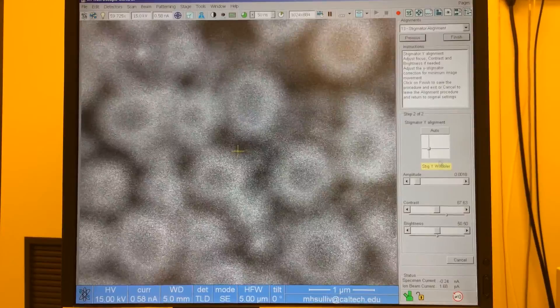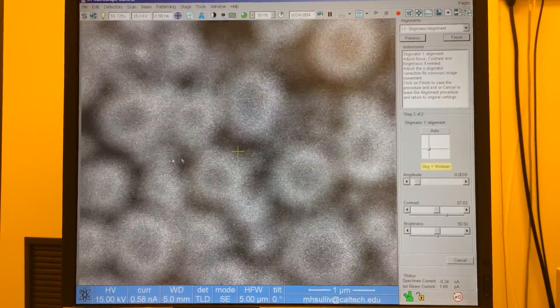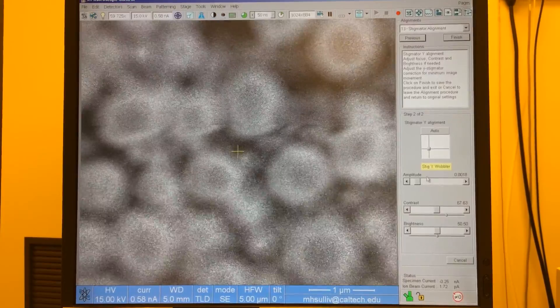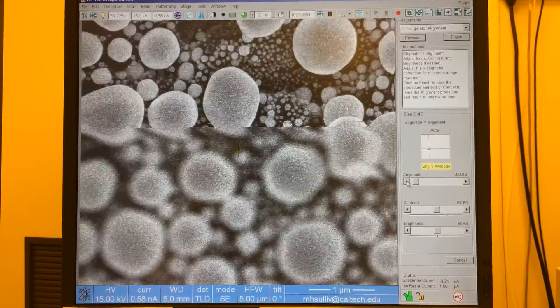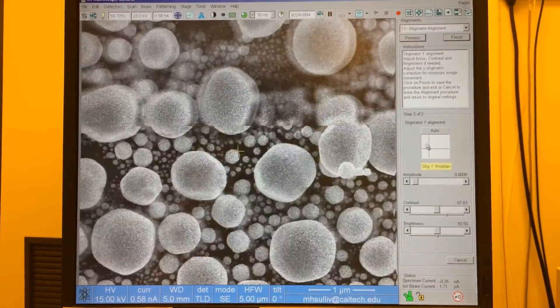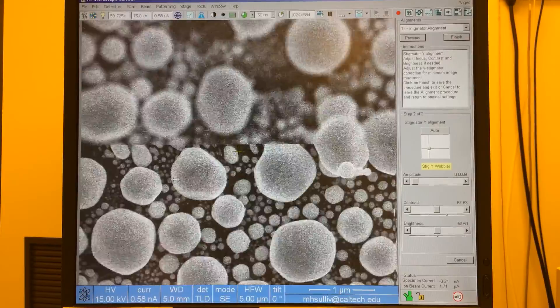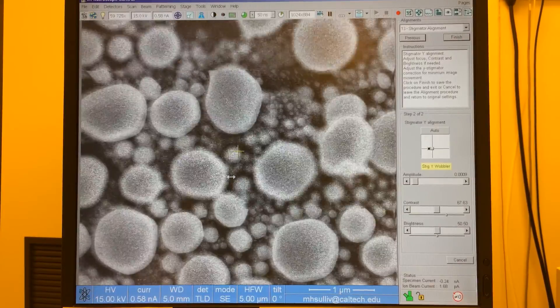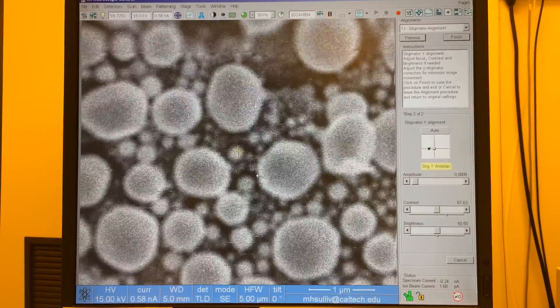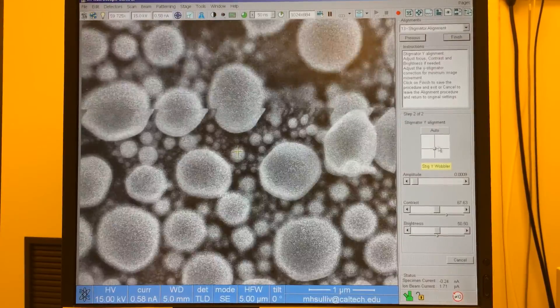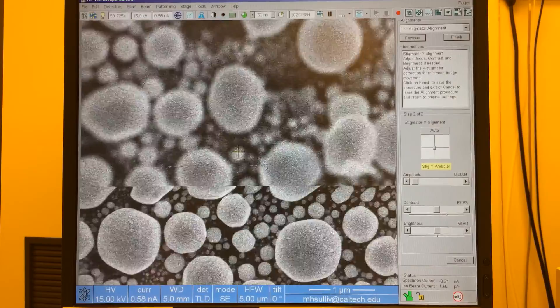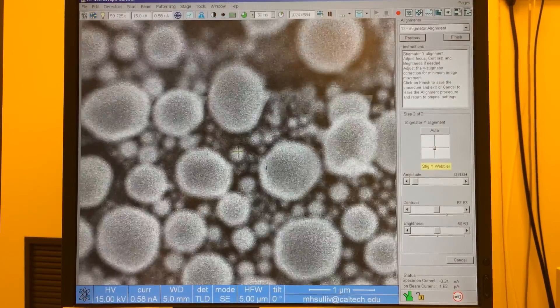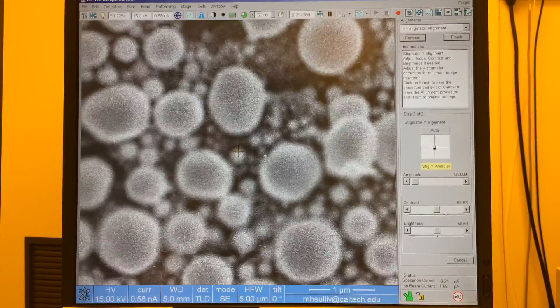Next we'll go to the y and you can see there's a heavy oscillation in the x direction. We'll drive down the amplitude so that we can see it a little bit better. And again we'll fix the x oscillation by grabbing the vertical bar and moving it left and right. Now it's only moving up and down so we'll grab the horizontal bar and we'll fix that so that it's only blinking in place.